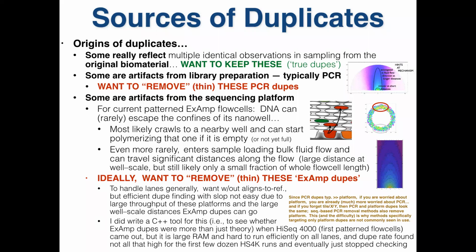It takes very large amounts of memory. I did write a tool for the HiSeq 4000 patterned flow cell, with large RAM, maybe 40 gigs depending on the length, to do this. And we did it for dozens of runs.